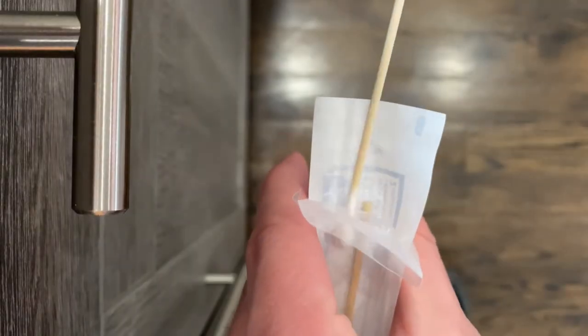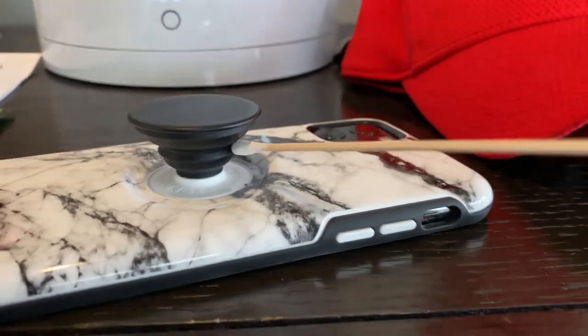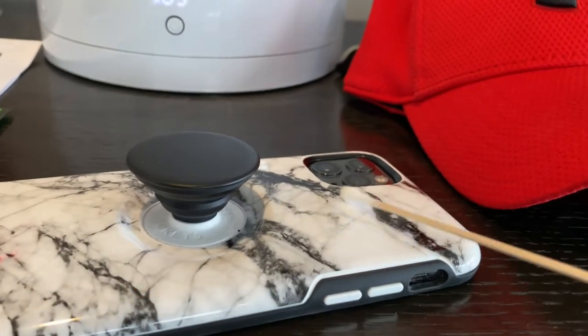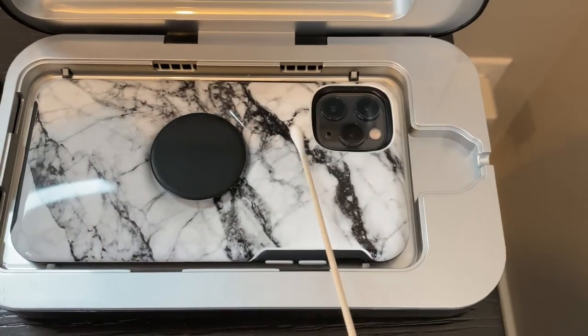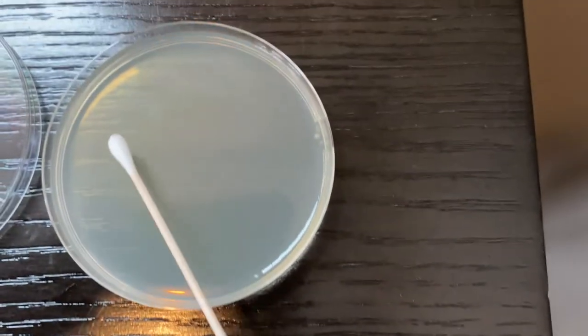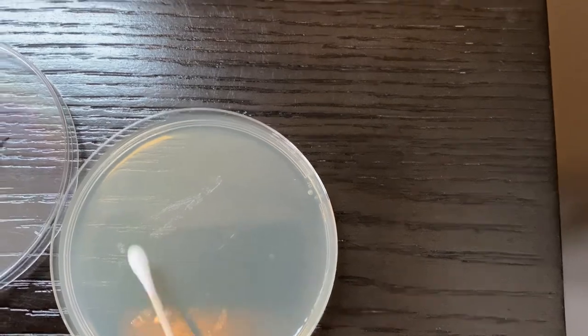Now we will get out our test strips so we can use the rest of the petri dishes. Currently I'm swabbing my boyfriend's phone, making sure to get under the pop socket and all the high contact places. And popping it into the PhoneSoap sanitizer. Swabbing his phone again directly out of the PhoneSoap sanitizer to minimize foreign contamination, and we will just get it right onto the petri dish.